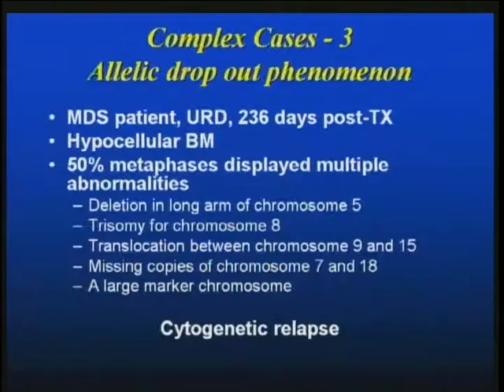And then occasionally we have this occurring. This happens usually with pediatric patients that are suffering from ALL, and about 10% of individuals that suffer from myeloid dysplasias. So it's not completely uncommon. What happens is that we observe this allelic dropout phenomenon, and I'll show you what this looks like when we're actually performing the analysis.